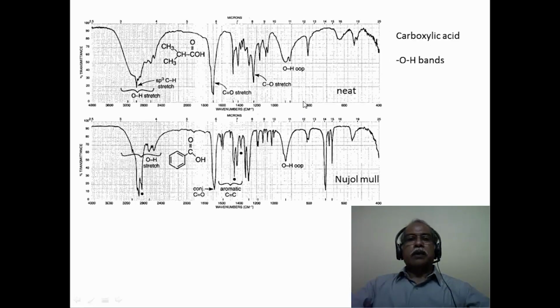Now this is the example of an isobutyric acid sample. One can see a very broad envelope of OH which is even masking the CH peaks along with it. So it is a fairly broad peak that is seen for the OH, consisting of this entire envelope of stretching frequencies, which also masks the CH stretching frequency, which you can barely see as a spike on the broad band of the OH stretching frequency. Carbonyl stretching frequency is also there. That is why it is a carboxylic acid derivative.